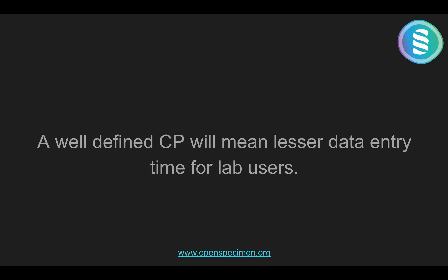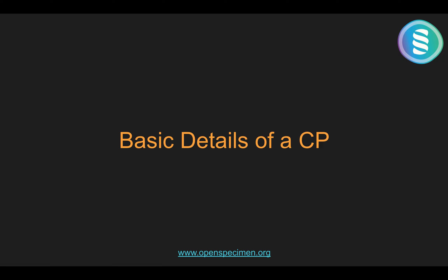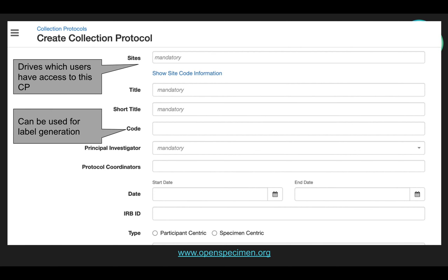A well-defined CP will mean lesser data entry time for lab users. Let's first start with some basic details of a CP. This is the collection protocol create page. The sites field will include the sites which will be involved in storage, specimen collection, and specimen processing. Sites will decide which users will have access to the CP and the freezers which will be available for storage for the specimens collected for this CP.